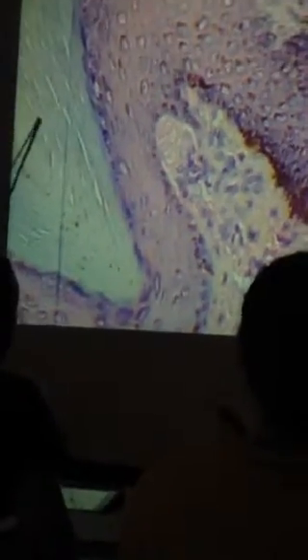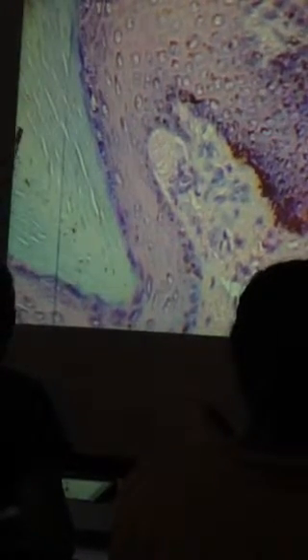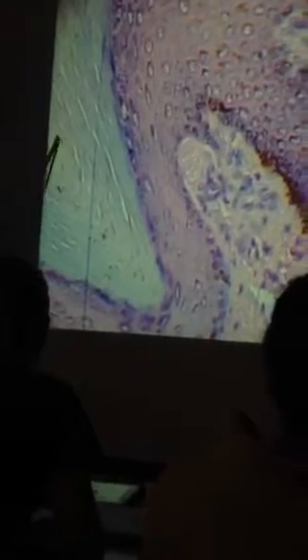All right, so what's this right here, this pink area? Okay, what's the purple? Right, and you don't see a very obvious lucidum here, so you really can't say whether this is thick or thin skin. But this out here would clearly be what? Corneum. Okay. If I ask you lucidum, then I'm clearly going to show you a layer that's obviously lucidum. Okay, what are these?